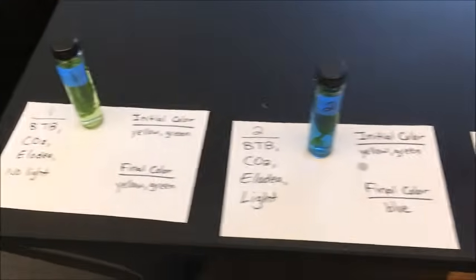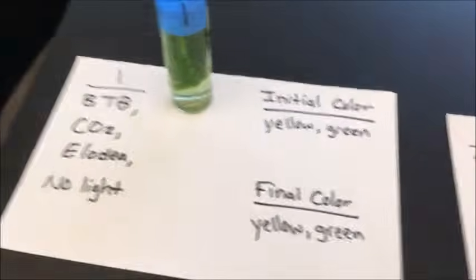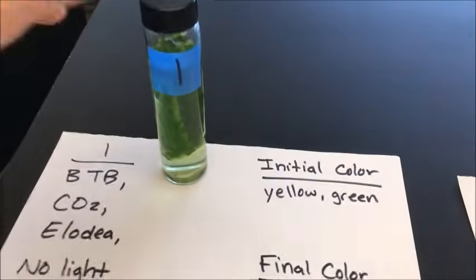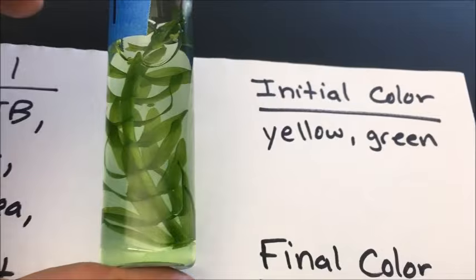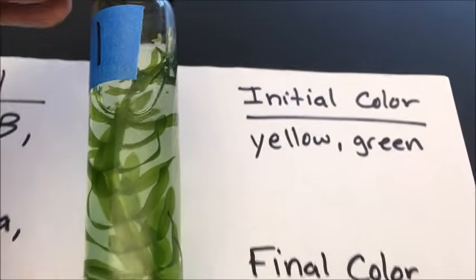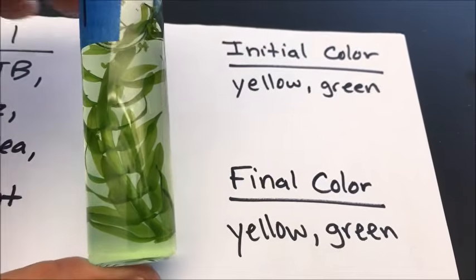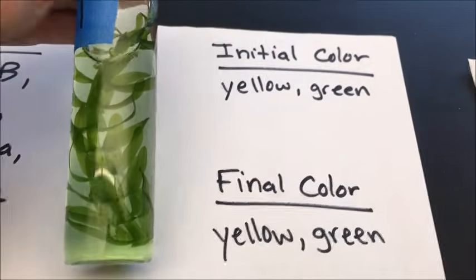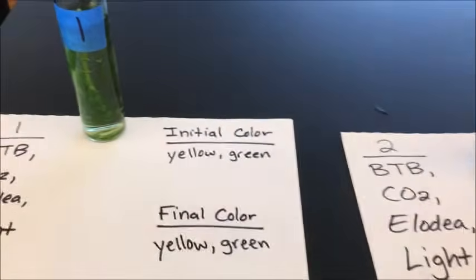Okay, so welcome. It is 24 hours later. The next day has passed. Let me show you the results. I've already gathered the tubes out of where they were stored. So notice the initial color of tube number 1 was a yellow-green, and the color inside is still kind of a yellowish green color. So no color change happened in tube number 1.